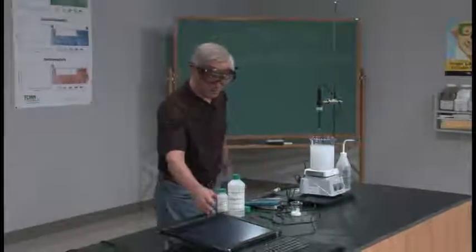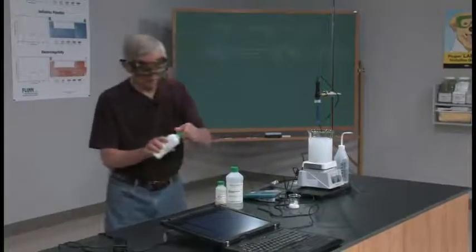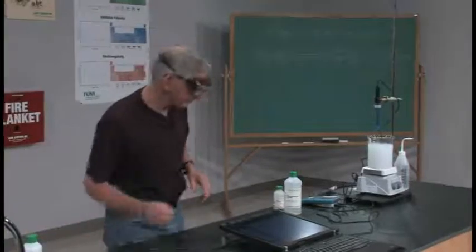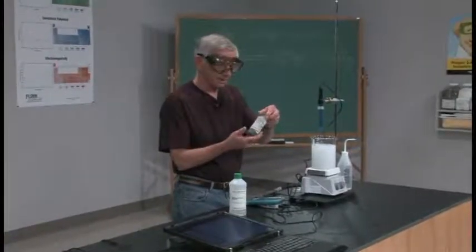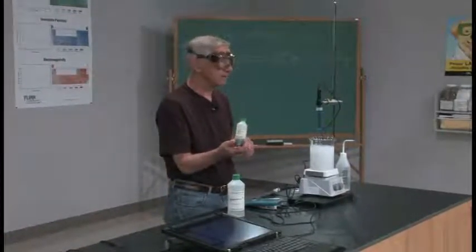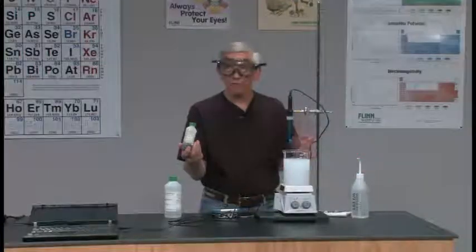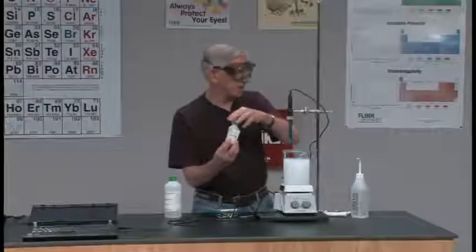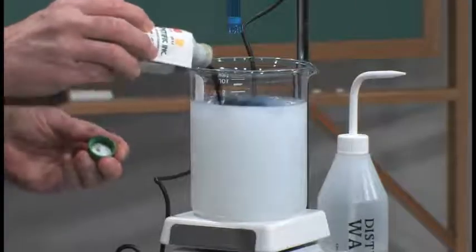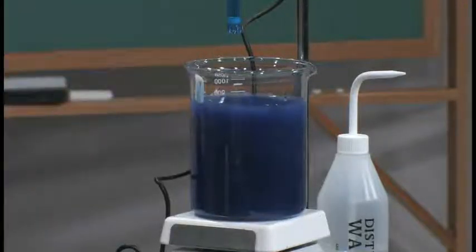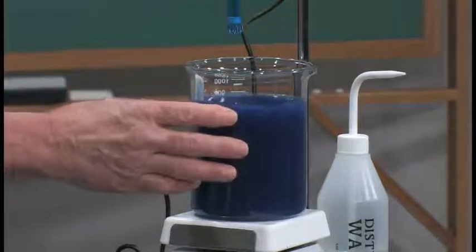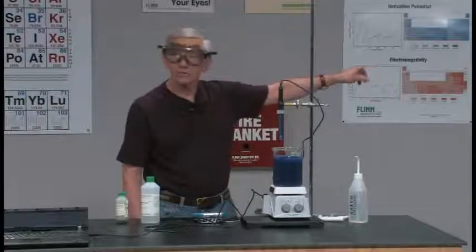So, we want to be able to trace the reaction. First, we're going to do that by looking at color. This is universal indicator. It will give me a pH range anywhere from about 3 or 4 with red up to purple. And we have a little chart on the side that comes with every bottle. It tells me that if the pH is up over 10 effectively, I'm going to have a purple color. I have a purple color. That's due to the hydroxide ions that are in the solution.